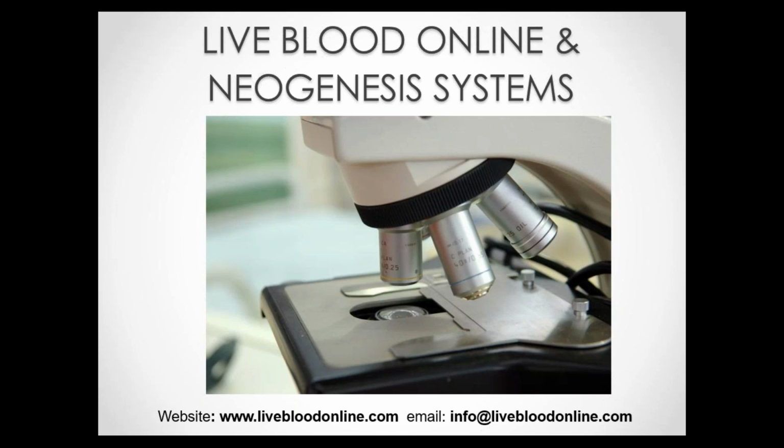Also, in terms of clinical studies, it's very difficult to put together a clinical study for live blood analysis, because many of the conditions that we're able to detect with live blood analysis cannot be detected or verified by conventionally accepted tests to the same degree of accuracy and sensitivity as live blood analysis. So that's one of the main reasons why there's only a small amount of research on live blood analysis, specifically clinical research or scientific studies.